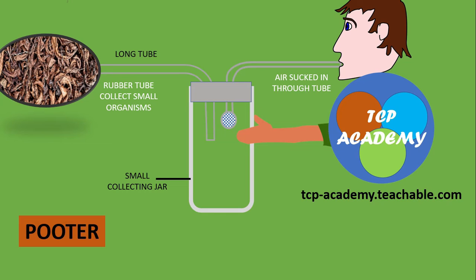Like we said earlier, it is just pretty much some tubes that are connected to the top of a special bottle, and at the end of the tube going into the mouth of the individual, there is a mesh or muslin to prevent the organisms coming in from getting into the mouth of the individual. We're going to be showing you the detailed setup after we have looked at the animation here.